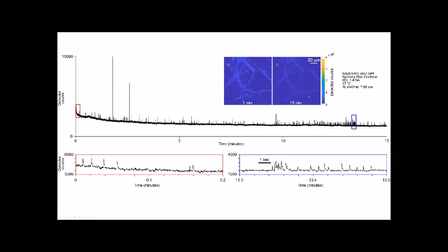I don't think that these experiments, even the spinning disk, so one reason why we did spinning disk confocal is because we were hoping to get rid of the out of focus events so that we could do spatial analysis on the extent of things. But even in this case, it's not ideal because there are still out of focus things that are just correspondingly dimmer. And we did these experiments very carefully.